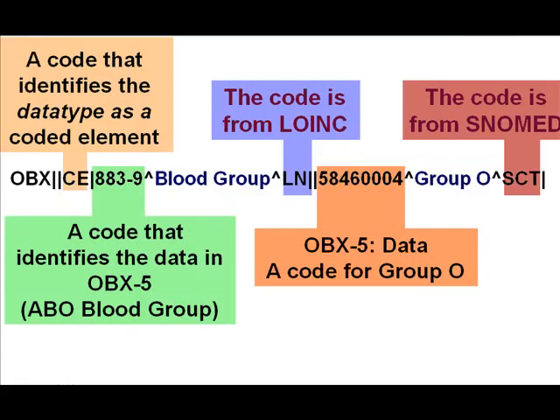And one of the things that we have talked about is that there's nothing that would prevent anybody from making a file that would show nice user-friendly names that everybody agrees to for these items. And it's work that we haven't done yet. There are short names for LOINC codes, unique short names for all of the lab LOINC.